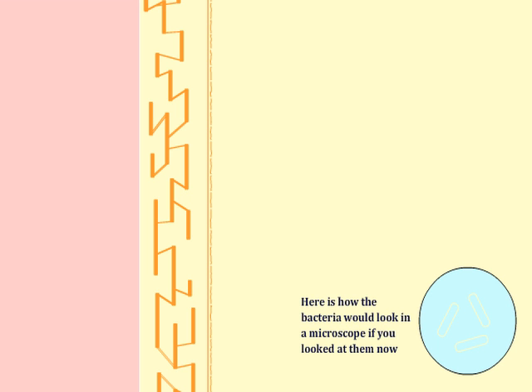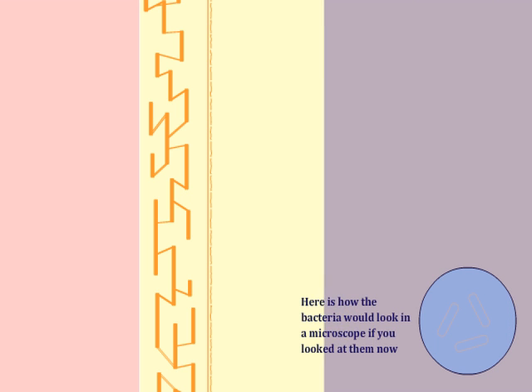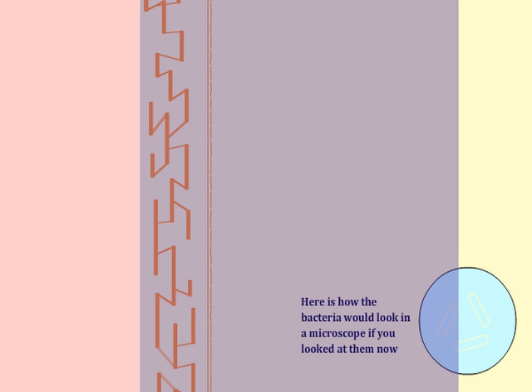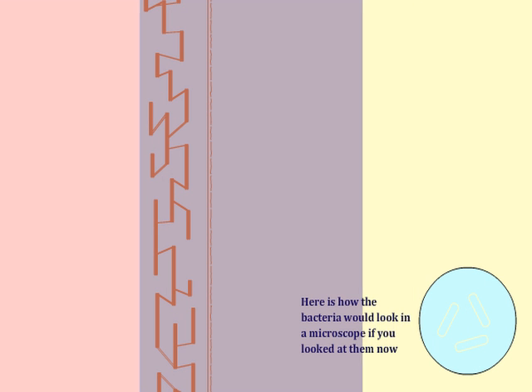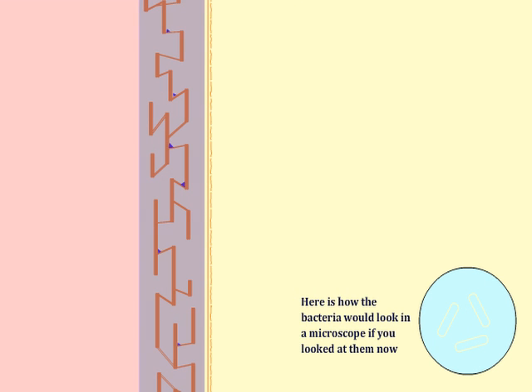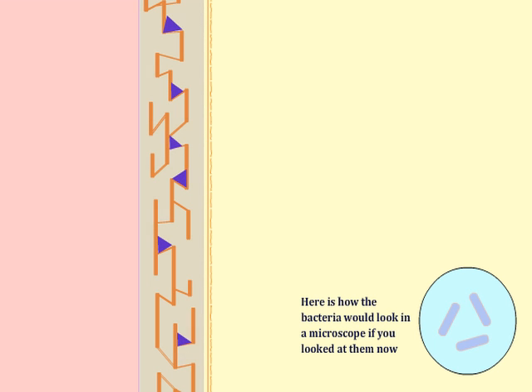After heat fixing the slide, it is first flooded with crystal violet for one minute and then washed. The stain colors the bacterial cell wall blue and the bacteria would appear blue in the microscope if examined at this point in the procedure.